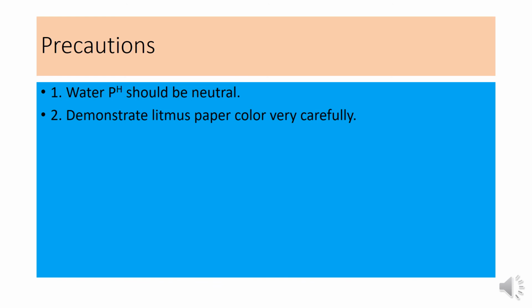In every experiment, some precautions should be maintained, and in this experiment, this precaution should be maintained. 1. Water pH should be neutral, and observe the litmus paper color very carefully.